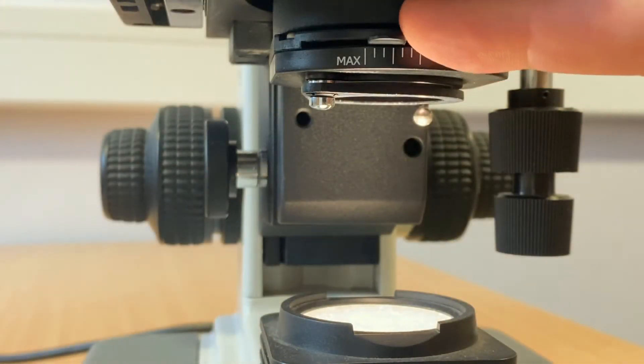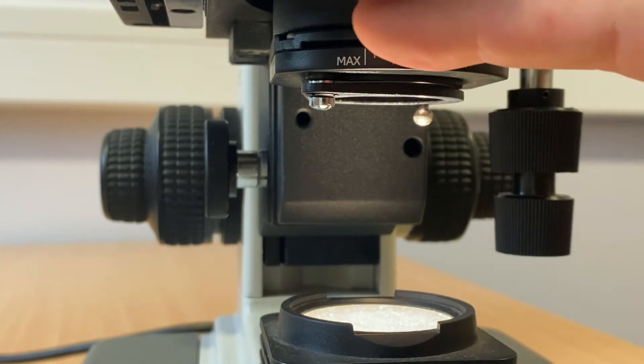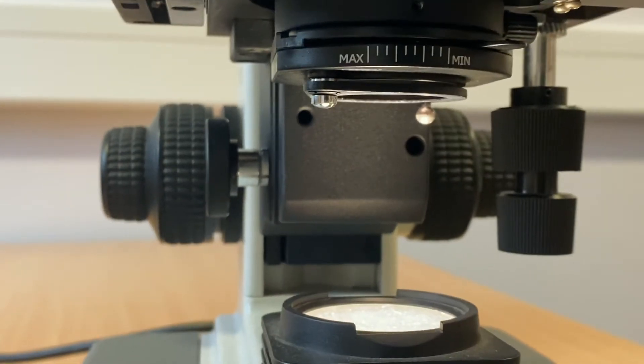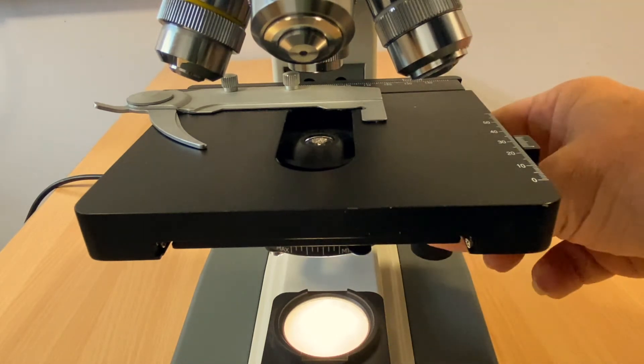Underneath the stage is the iris diaphragm control. This will improve contrast and visibility when viewing your specimen. Precise location of specimens can be achieved by using the micrometer scales on the top of the stage.